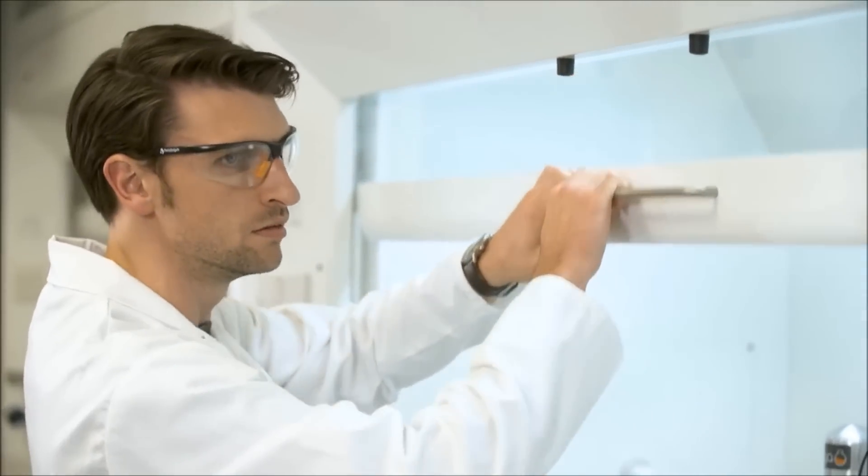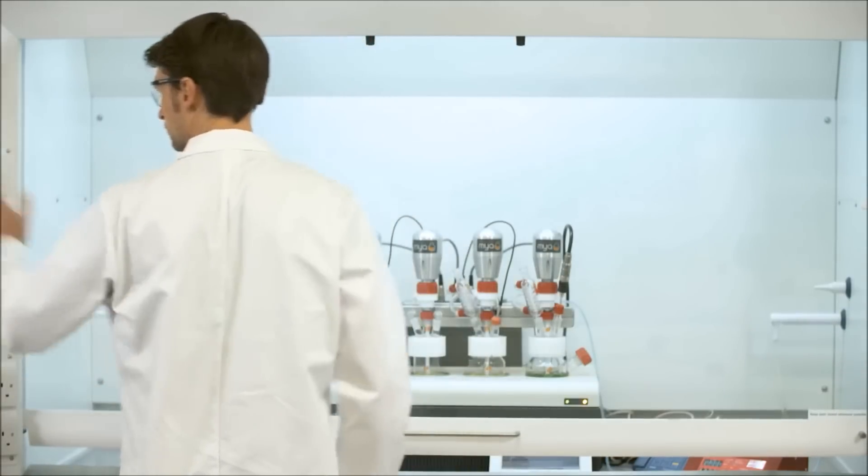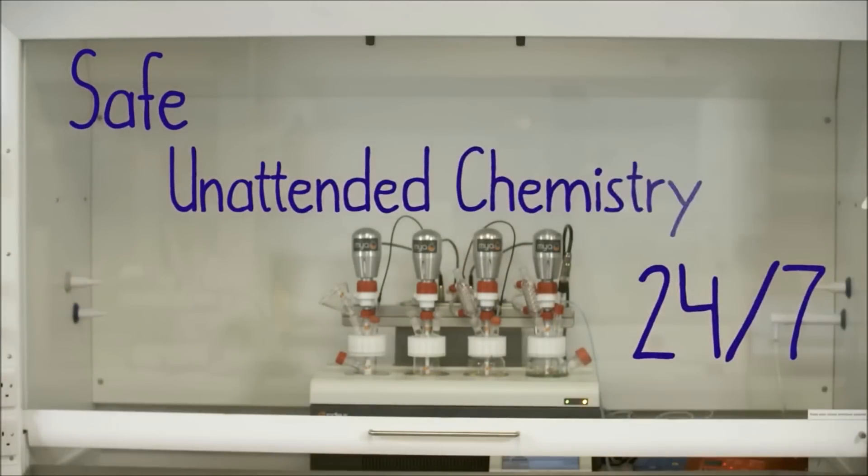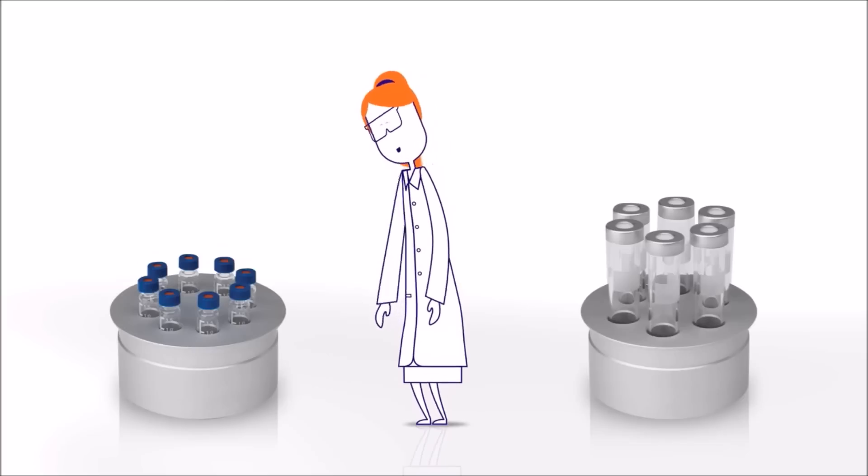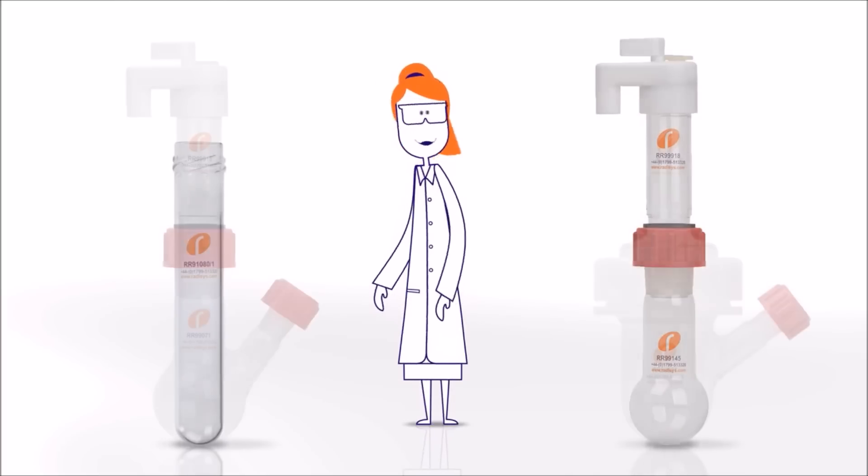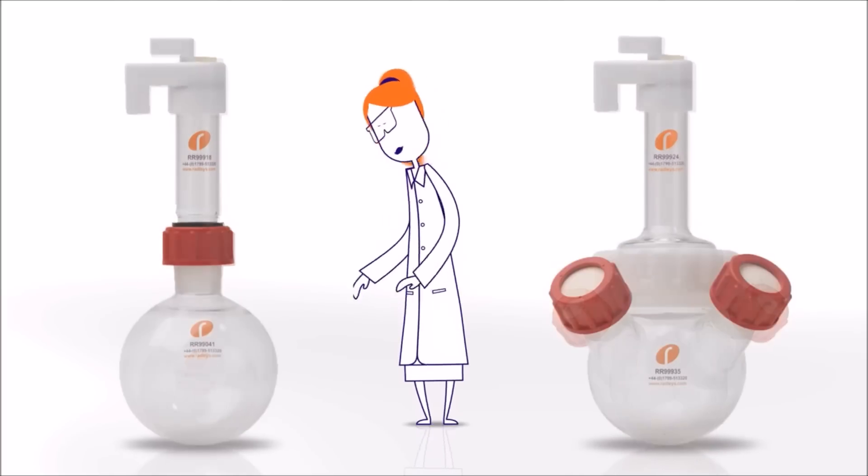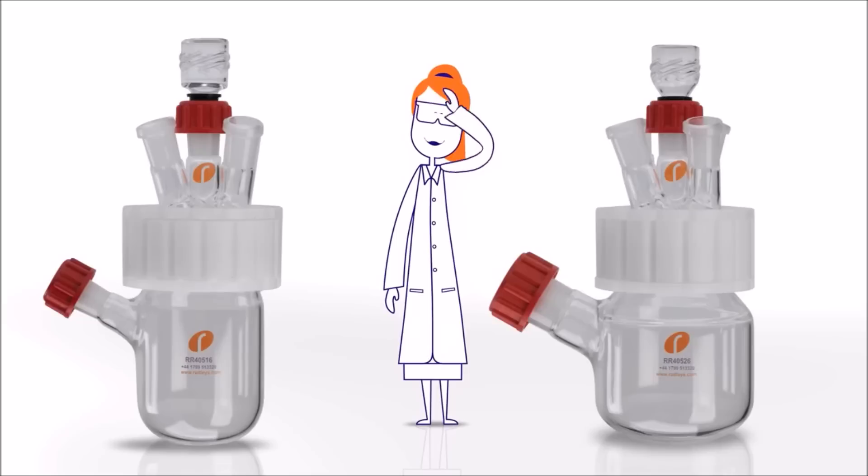Maia 4 offers safe, unattended chemistry round-the-clock 24-7. With a wide range of vessels and accessories, Maia 4 allows you to work at the scale that suits your chemistry.